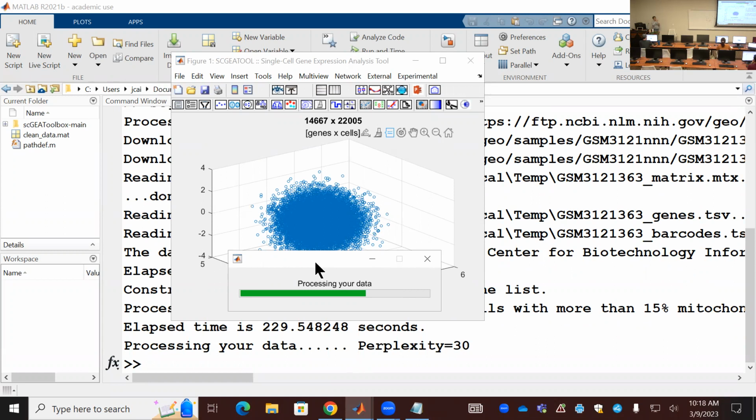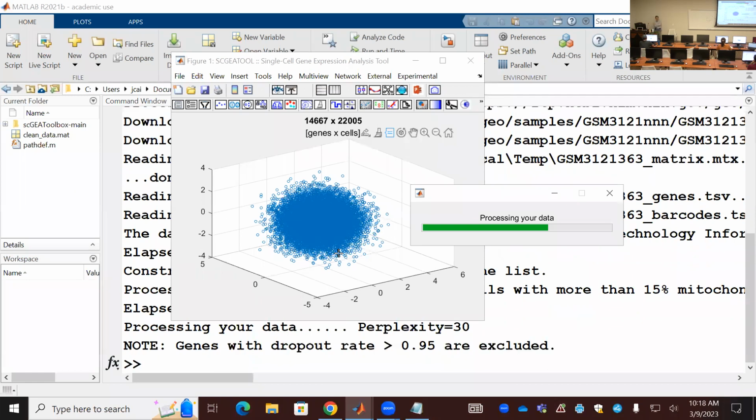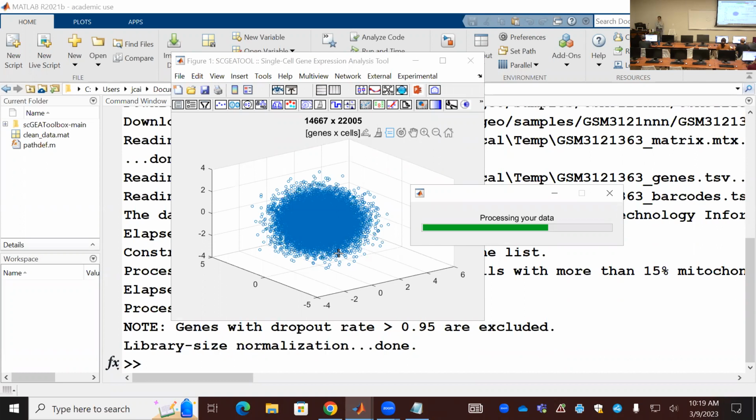Perhaps just a routine. Okay, you should know this very well wherever you have a data set. To do this initial process, we need to know clusters, we need to know cell types. Especially in our case, we need to have cell types because we are going to detect interactions, right?